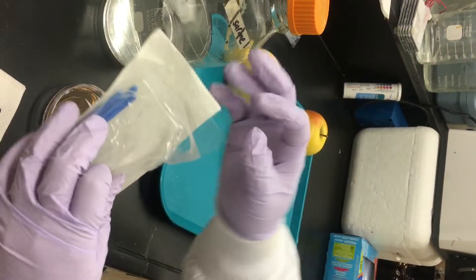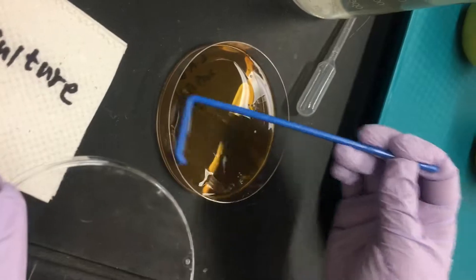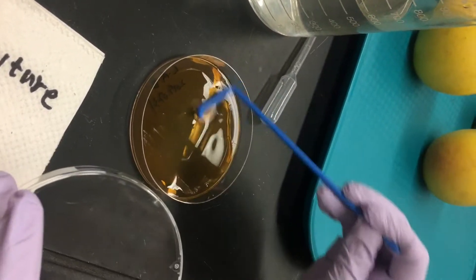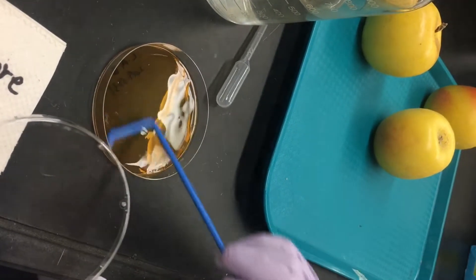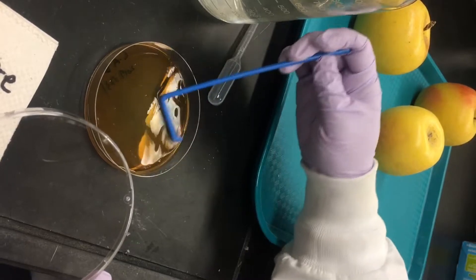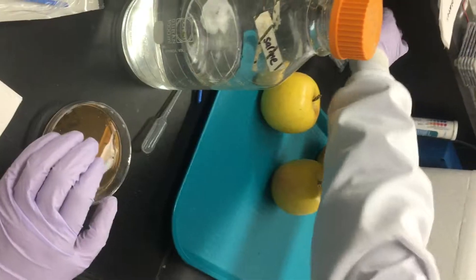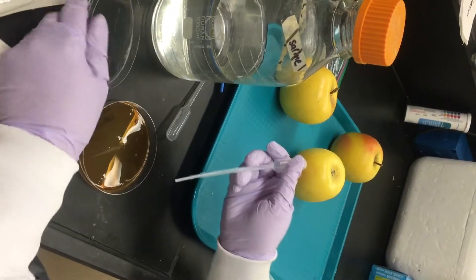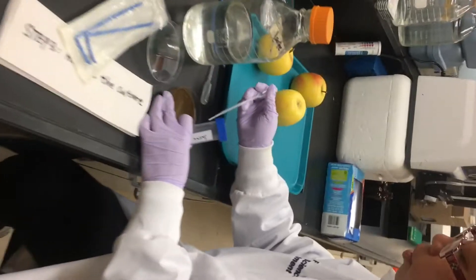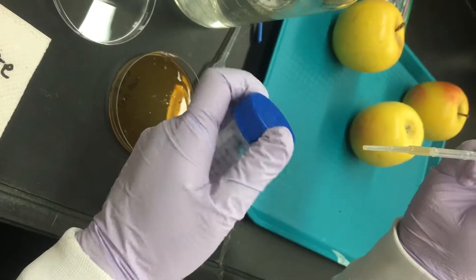Take the L-shaped spreader and get the colony off. Then take a new transfer pipette, collect the culture, and transfer it to a clean tube.